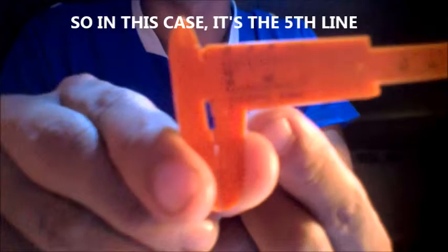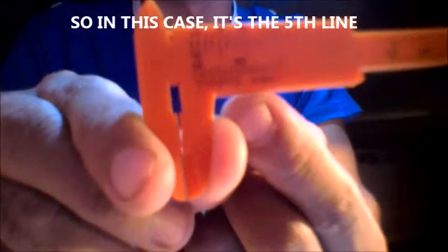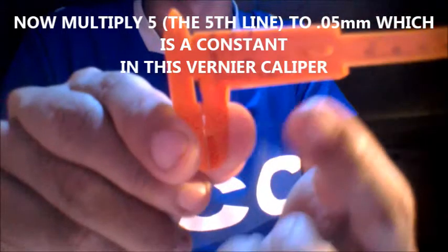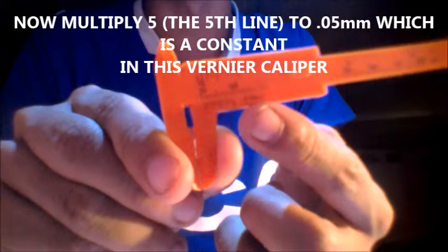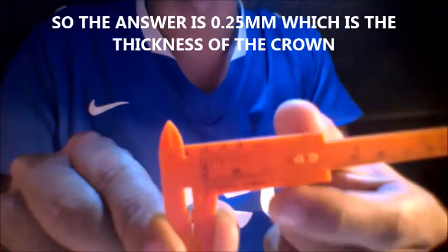So in this case, it's the 5th line — the 5th line from 0, from here to here, it's the 5th line. Then multiply 5 by 0.05, which is a constant in this vernier caliper. So the answer is 0.25 mm.